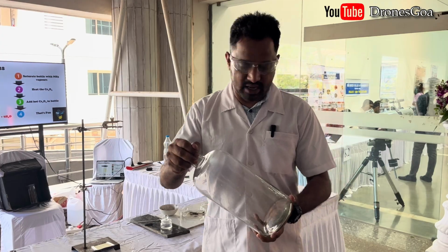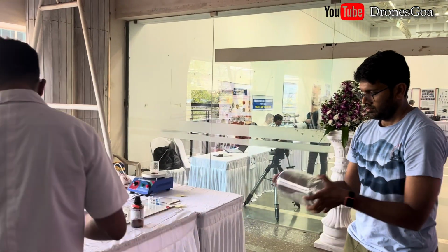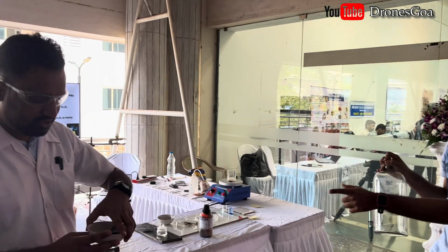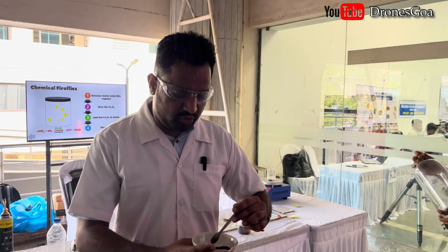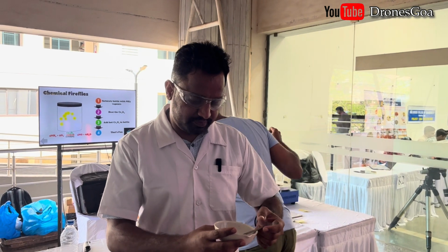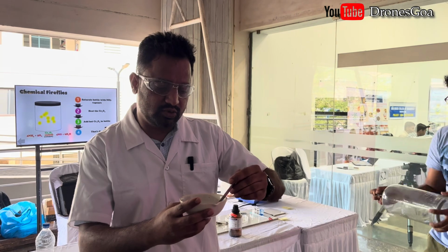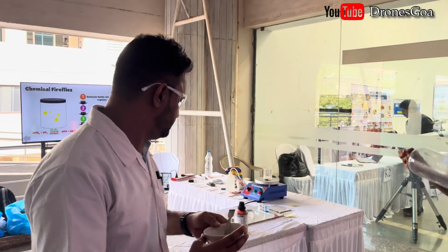I'll hand over this to Dr. Mithil. He will do the needful. Now what you see over here is the chromium 3 oxide catalyst which we have produced. We have produced this material with a very high surface area so that it acts as a catalyst.